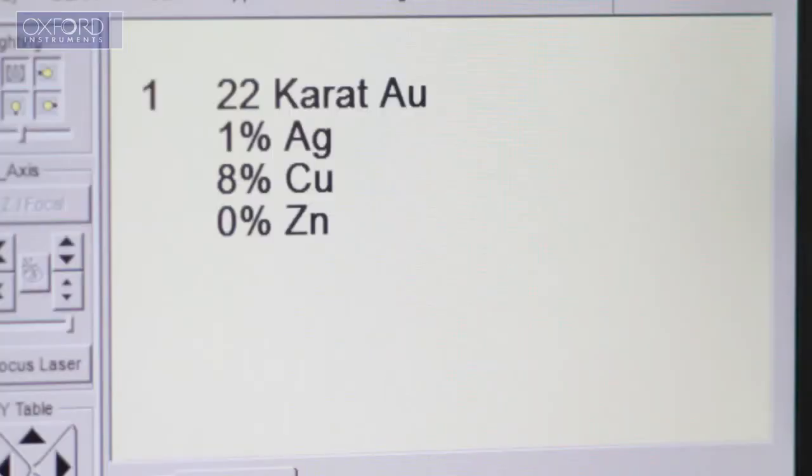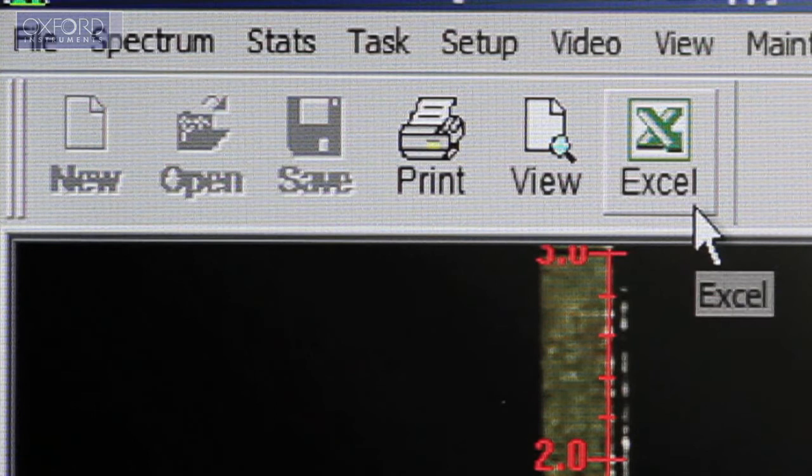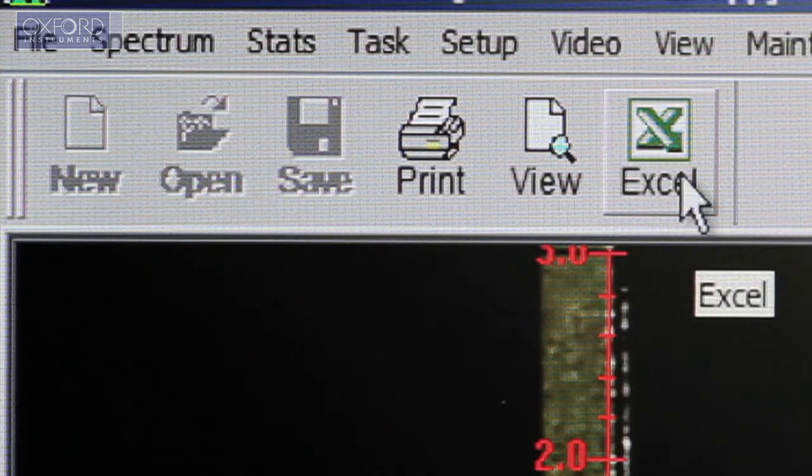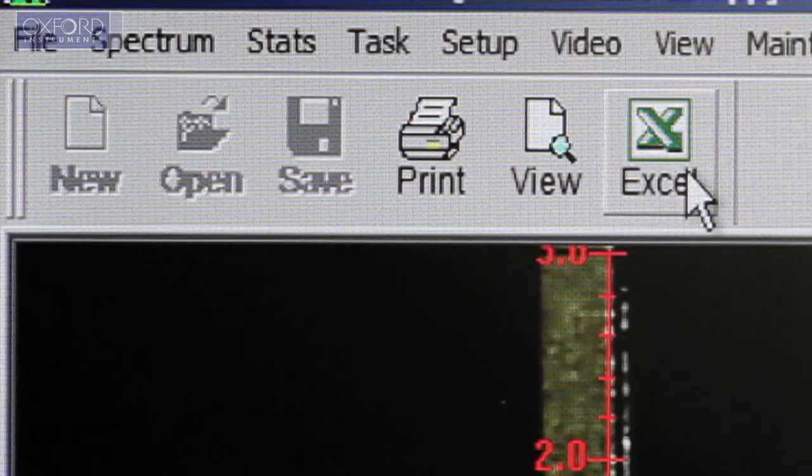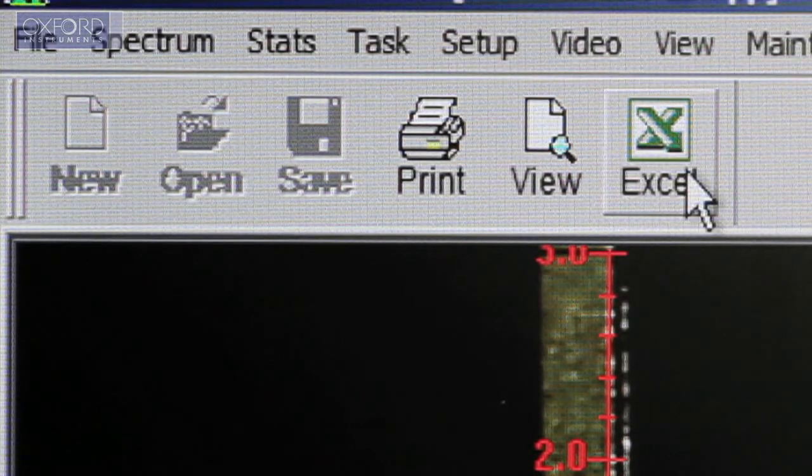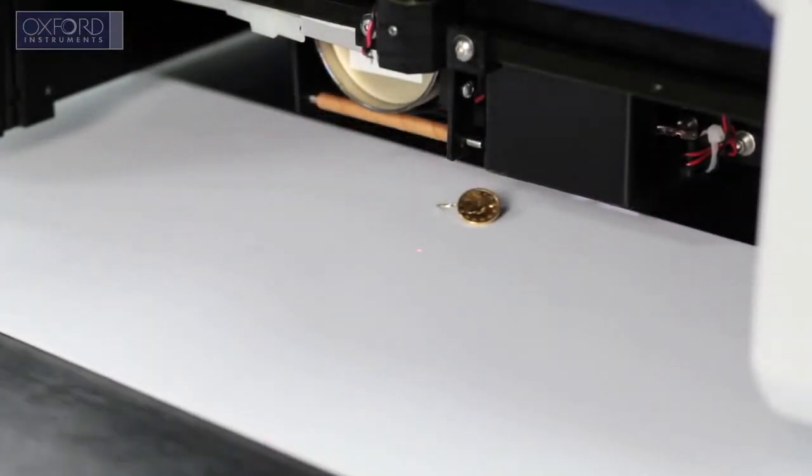You can then save the results for future reference, export into Excel, or print them as required. The door is lifted and the sample removed.